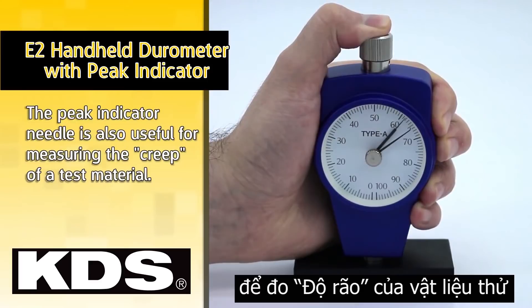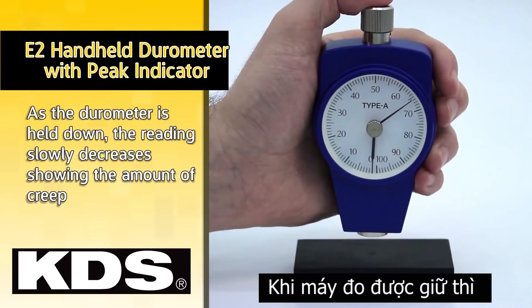As the durometer is held down, the reading slowly decreases, showing the amount of creep.